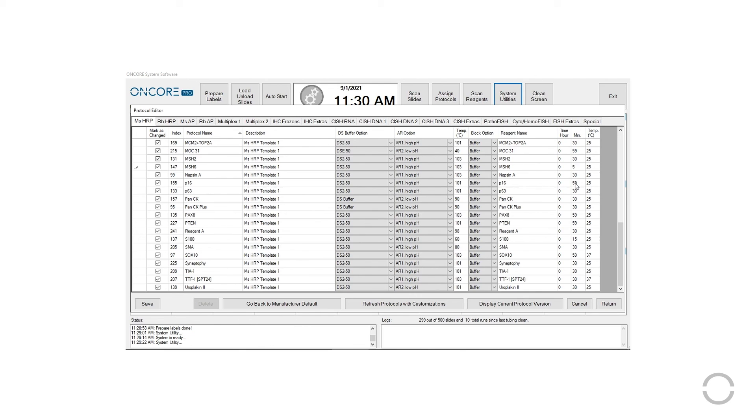When you are finished making changes, click Save and then Return to exit.